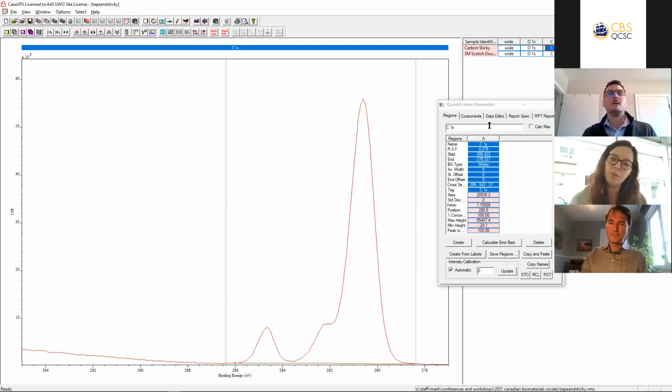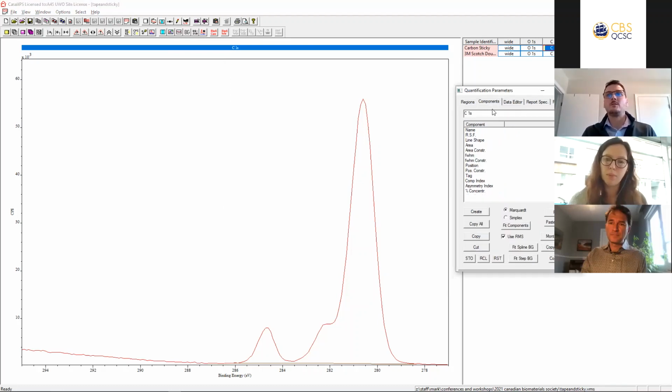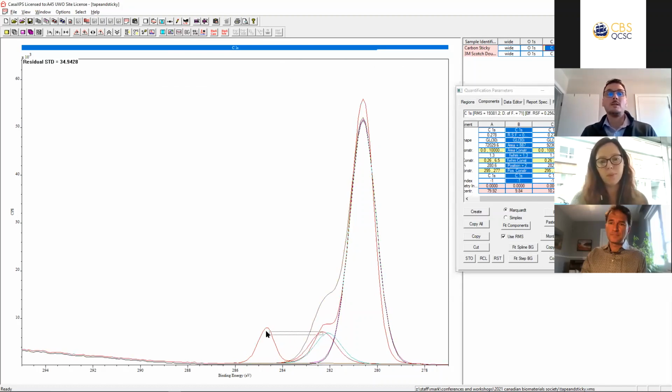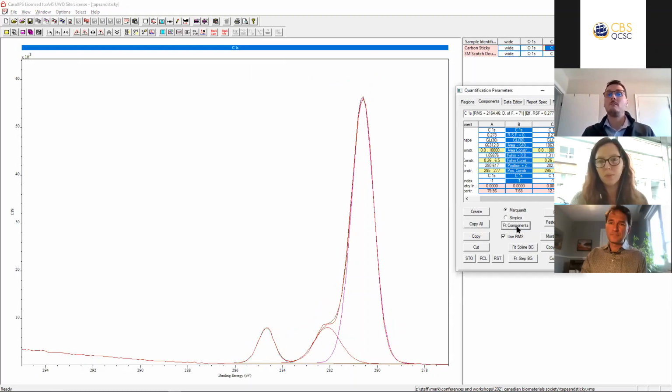So if we look at the carbon peaks, we can just add some peaks. So there's a peak, there's a peak, there's a peak. And you can kind of see that there should be peaks there. That kind of makes sense. And if we just hit fit like that, we're quite a long way from having an accurate fit. This looks a little off.